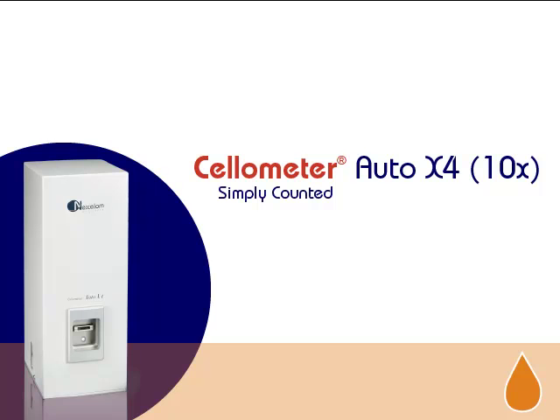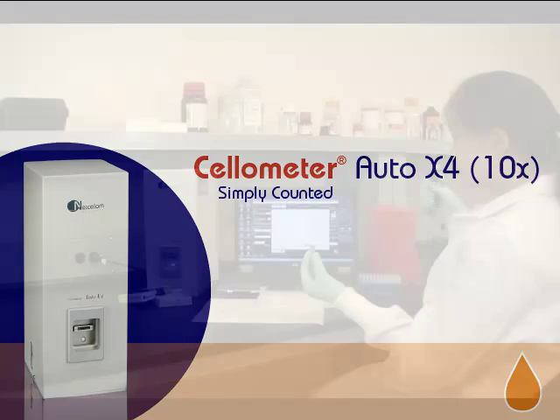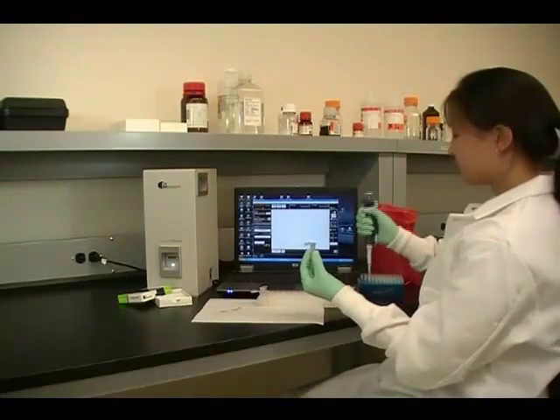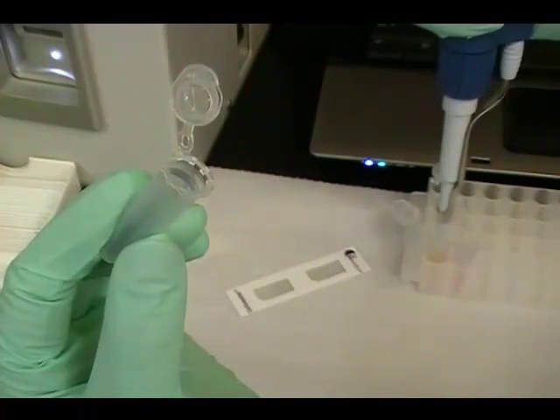The Cellometer Auto X4-10X is an image-based, single-fluorescent instrument optimized for one-step determination of yeast concentration and viability.